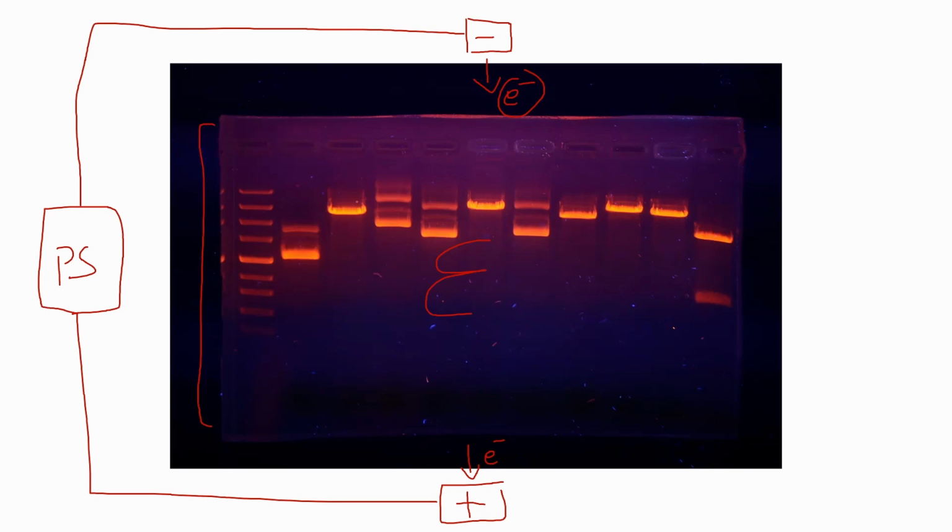So for example, if we take a look at this sample here, it can be DNA or it can be protein. In the case of DNA or RNA, they're both negatively charged, so naturally they will move downwards towards the anode. As for proteins, proteins would be treated such that they are negatively charged or coated with negative charges so that they also can move downwards towards the anode.